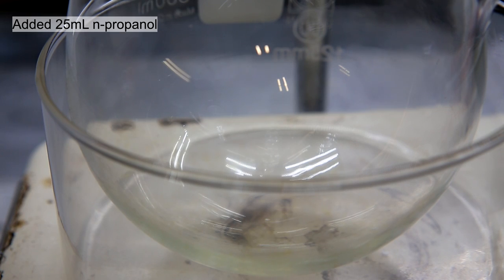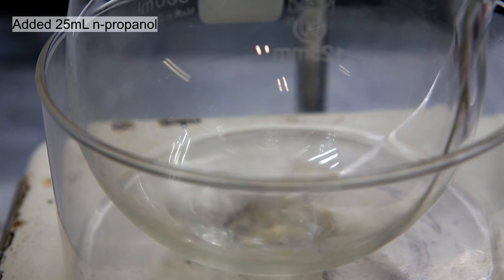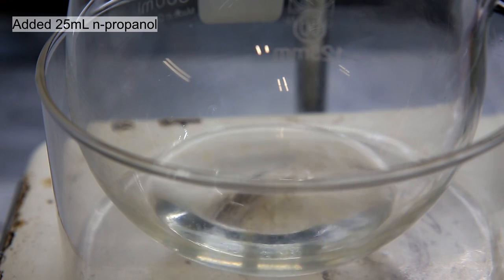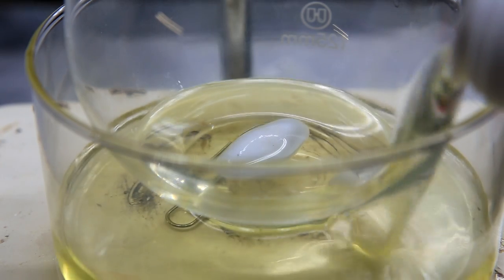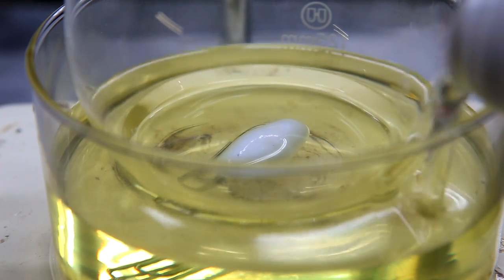Then to a 500 milliliter three neck round bottom flask was added 25 milliliters of n-propanol. Then the oil bath was prepared by adding oil to a crystallizing dish.